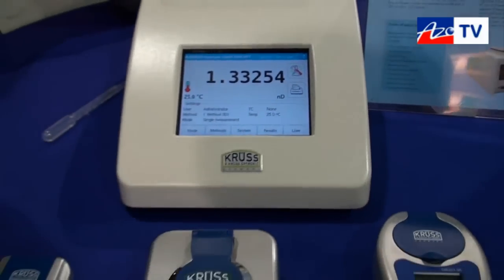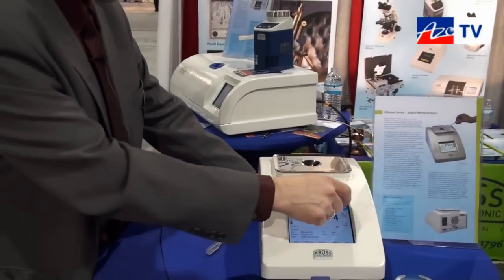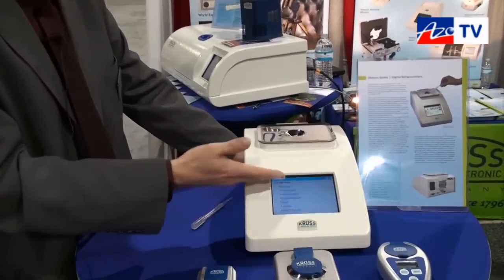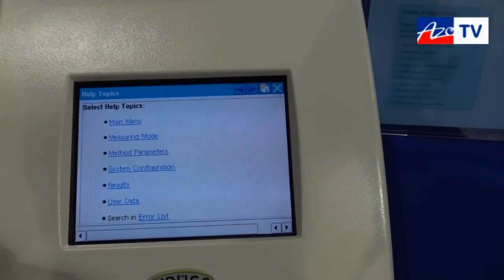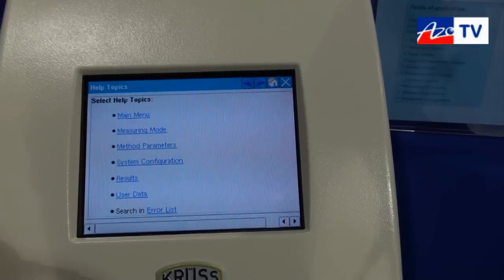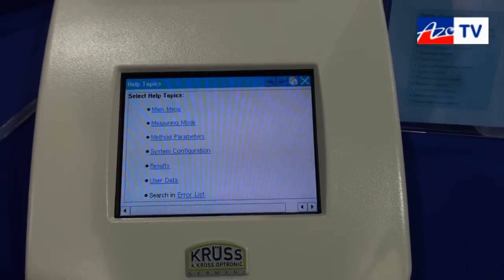As you can see, it's very easy to use with the touchscreen. There's also an on-screen help function. If you need a little help, you can find it here — it's written as a short manual. So if you can't find your printed manual, you have a quick reference available here.